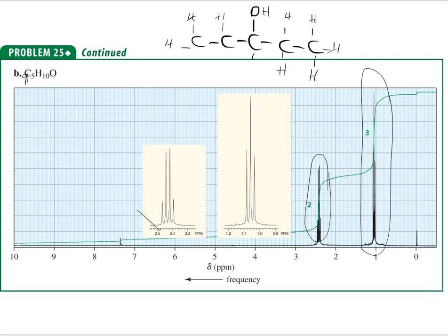So I'm going to maybe go with my gut, and I'm going to draw the double bond here with that oxygen. Do we have enough spaces for the remaining hydrogens, or do we run out? So let's see, at this point, they all are pretty happy. 1, 2, 3, 4, 5, 6, 7, 8, 9, 10. So we've got 10 hydrogens, we've got 5 carbons, and we have a double bond O. So chemical composition-wise, makes sense.